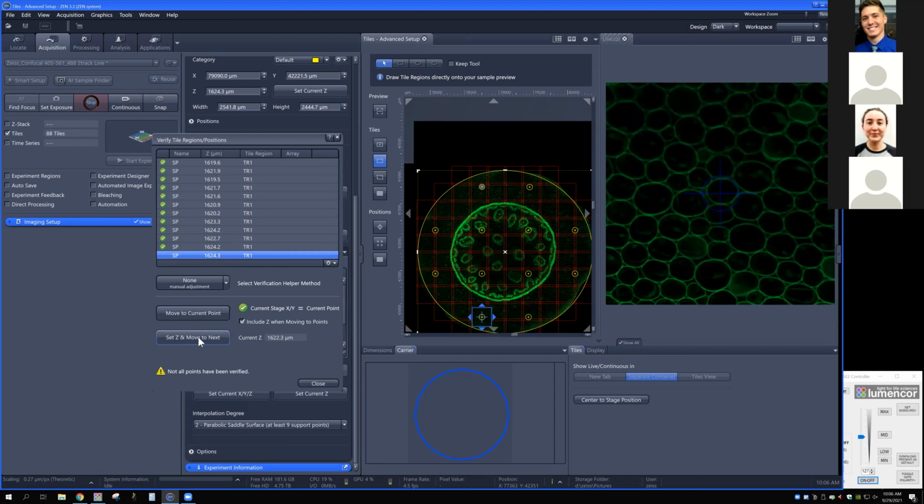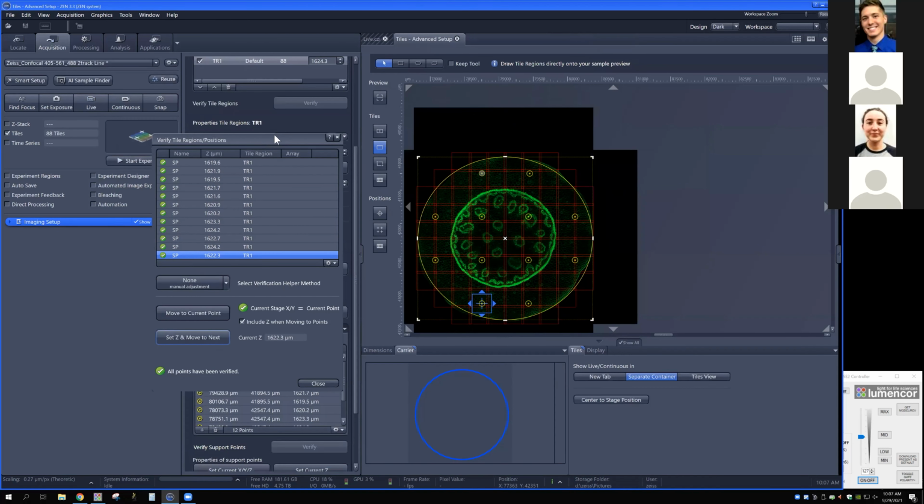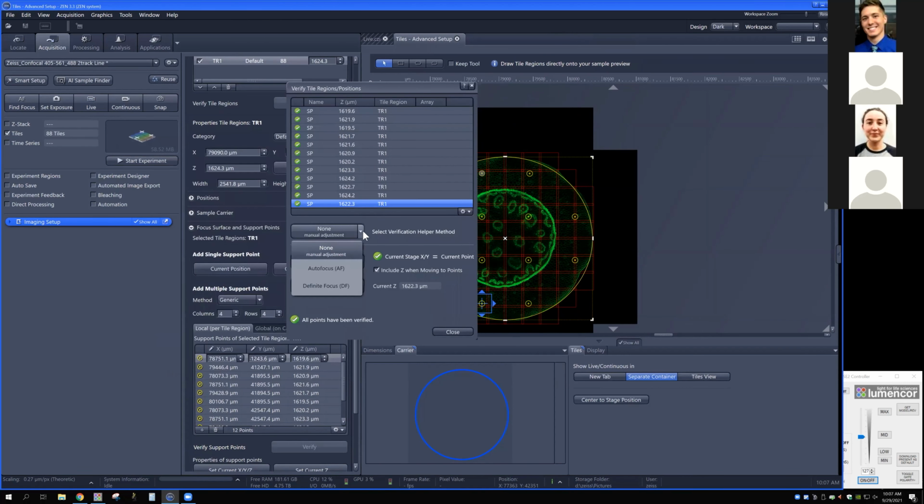So hopefully that looks pretty easy. And we're done basically, so I can turn off the live view. I will mention that technically, if you wanted to, you can use instead one of our focus strategies here. It would be automated in that case, and certainly doing it with definite focus can help. But I truly find it faster to do it just manually because it's very quick to run through and do this.